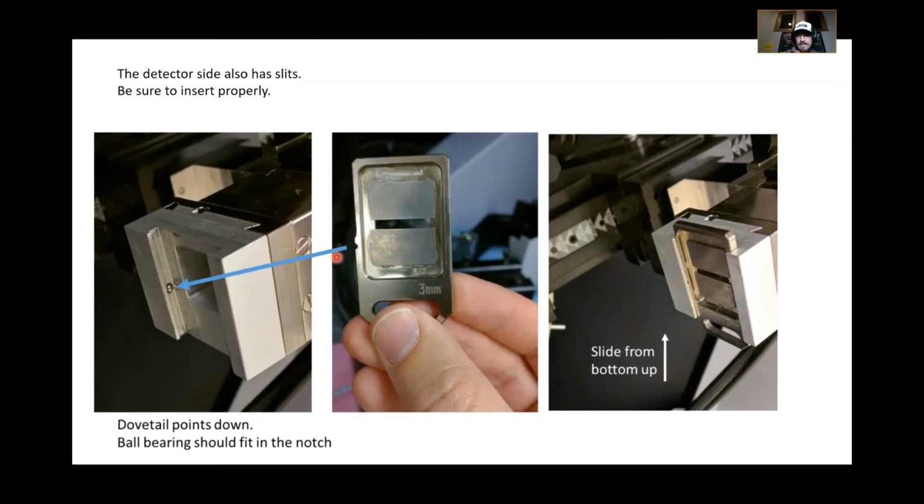I'll admit this because I admit it all the time. One time I dropped one, and then the piece fell right off, and I was very upset. I thought I had done a great deal of damage, and so I went and got what any engineer would get, either duct tape or super glue. In this case, I got super glue, and I looked very closely at it, and I could see the glue left over from the last person who had dropped it and broke it. And so these are pretty sturdy. You can glue them back together. I don't recommend that as a regular practice, however.